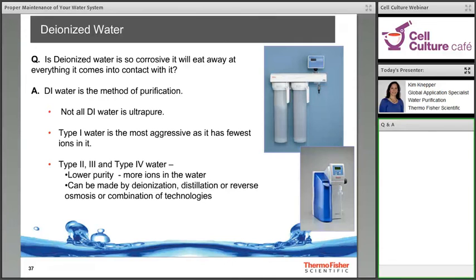Now, note, while manufacturers may have a very specific resistivity or conductivity range that the water must be in to be used with the lab equipment, for example, Thermo Scientific incubators have a recommendation of the water to be 50,000 ohms to 1 megohm quality, it's often difficult to zero right into that exact purity with even a simple DI system. But with brand new cartridges, even a simple DI system could be above 1 megohm. But also note, in some cases, the lab equipment will tell you if your DI water is too pure.